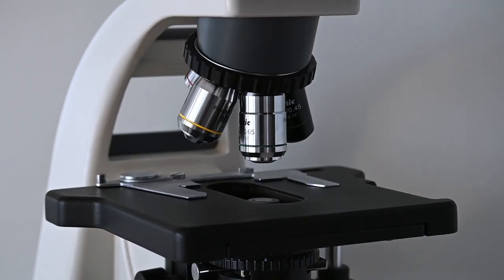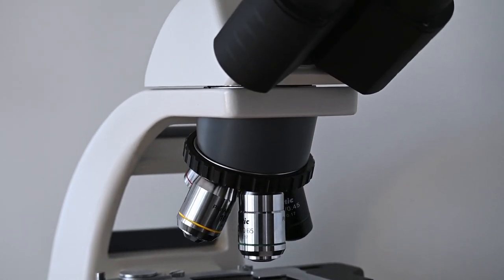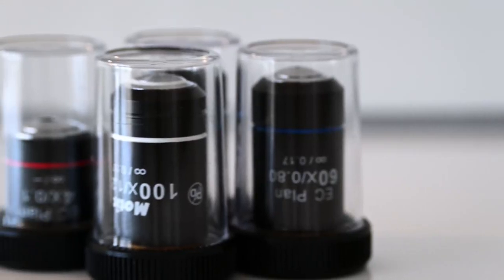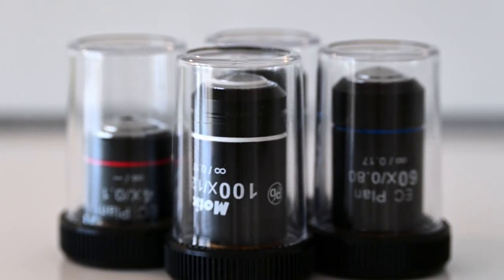The microscope I use is a BA-310 from Motic. This one is the trinocular version, which means that it has two eyepieces as well as a third port to mount a camera. As new, this one costs about 1400 Euros or 1700 American Dollars. This one is the Elite version, which means that it comes with slightly better optics, as well as the ability to switch between halogen and LED illumination. But I almost always use the LED module because I prefer the bluish light over the yellow tones from a halogen bulb.